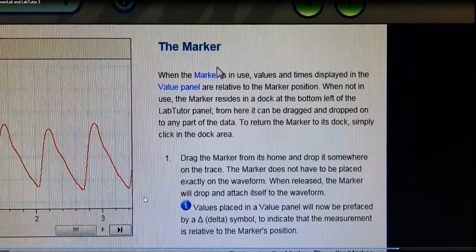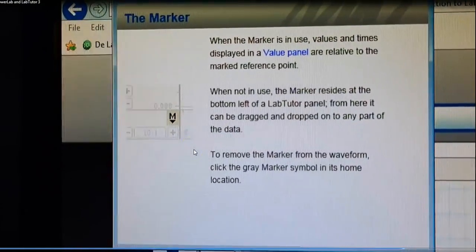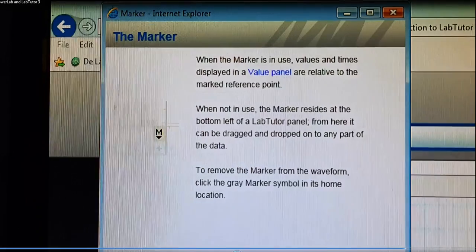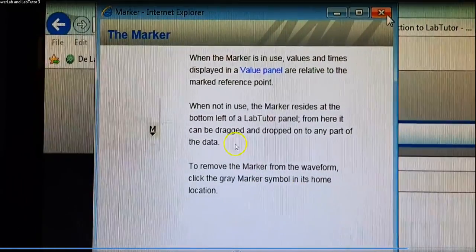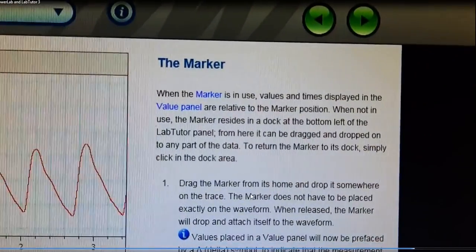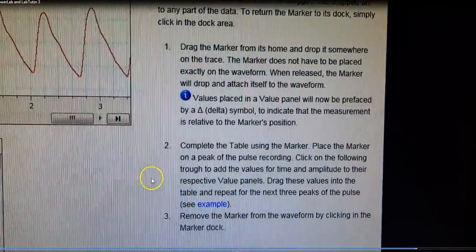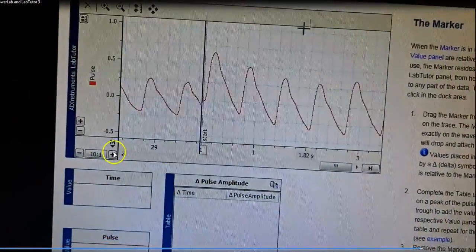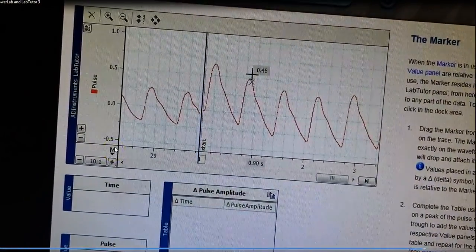Okay, so basically, even if you don't hit the exact location, you already know your intention. Here, this is the marker button. So there you have the marker button. Remember your horizontal scale and ratio button. Just above that you have your marker icon.